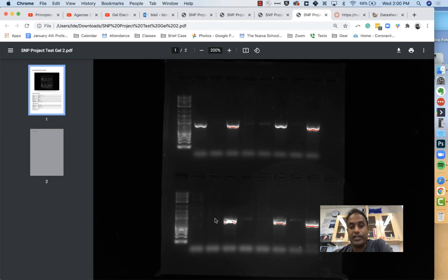Now, if my primers didn't work, that's going to be another problem. And the way we can figure out whether my primers worked or not versus whether or not I have DNA is by running my primers on several different people's DNA. So somebody had to have gotten DNA in one of the groups in this class. And if I run my primers with everybody else's DNA and it shows up, that means I have successfully isolated DNA. If I didn't successfully isolate DNA, I need to re-isolate DNA. If I didn't have successful primers, that's a little more complicated, and we'll need to talk about that.